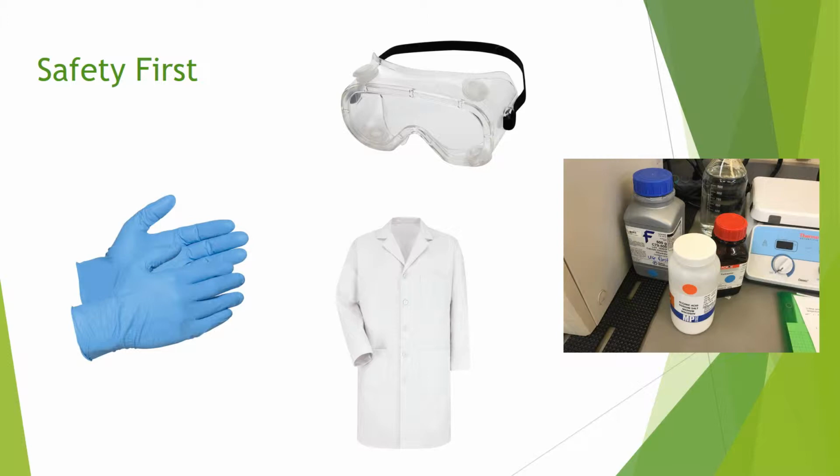Any solutions containing tartrazine, calcium chloride, or alginate had to be disposed in a hazardous waste container, while needles and syringes were discarded in a sharps container.